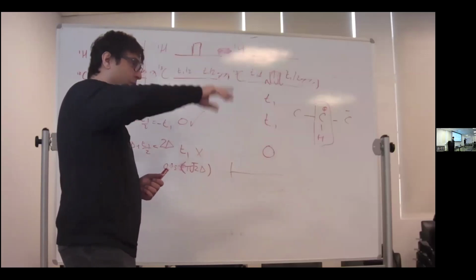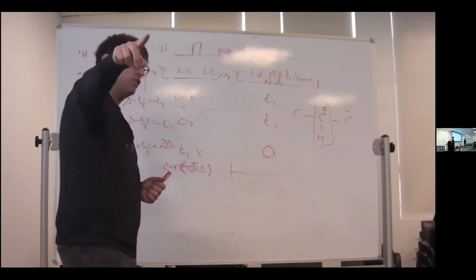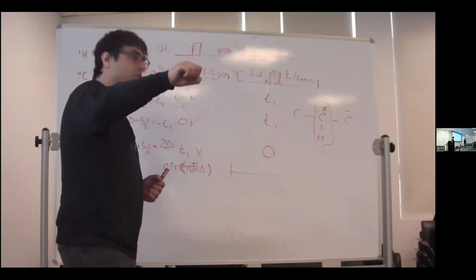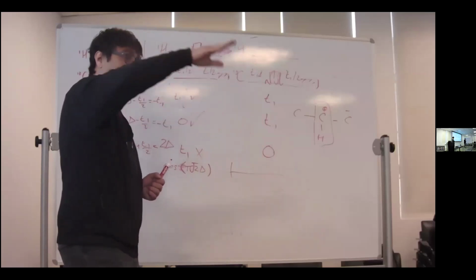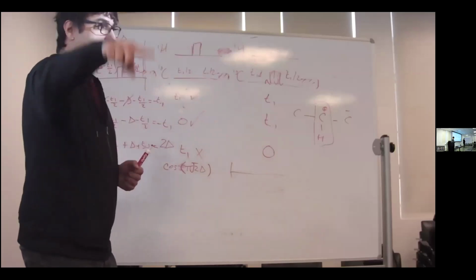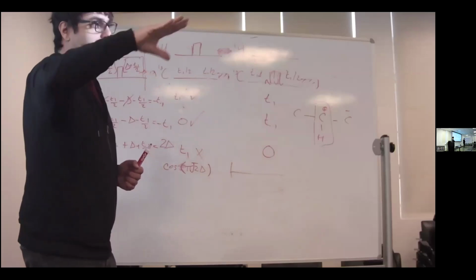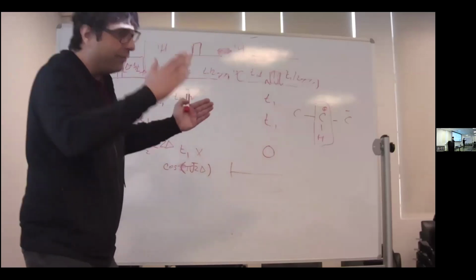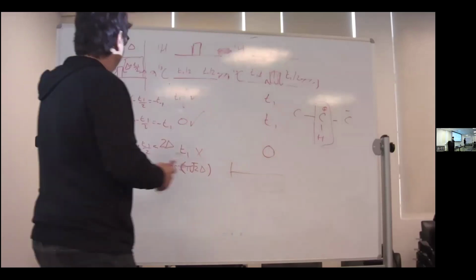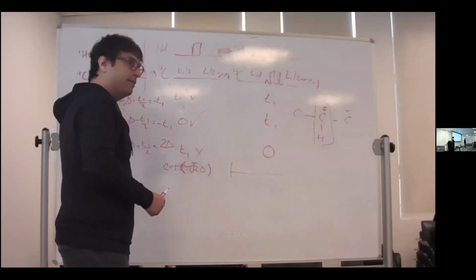And one of the advantages of that is you can do linear prediction. Because the sinusoid looks pretty regular, you can do a mathematical manipulation to increase the number of points artificially, because of the limitations imposed by delta.